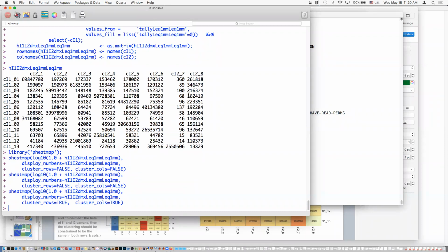We haven't talked about UMIs yet, but the ideal library preps are dual index UMI. It's easy to say, but protocols are protocols. You can't just wave a magic wand and make everybody do unique dual UMI. Library protocols are entrenched. It's sometimes not trivial to actually modify protocols to do those things. People have long-term projects. They want all the preps within the span of the project to be consistent.